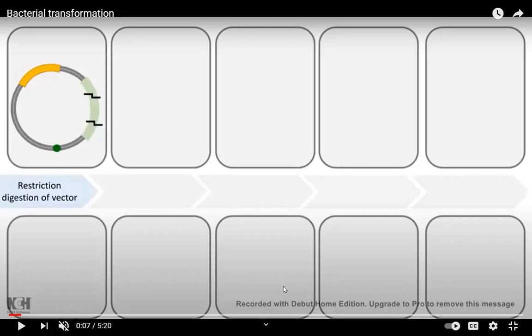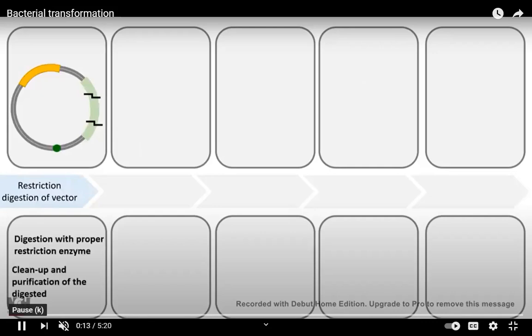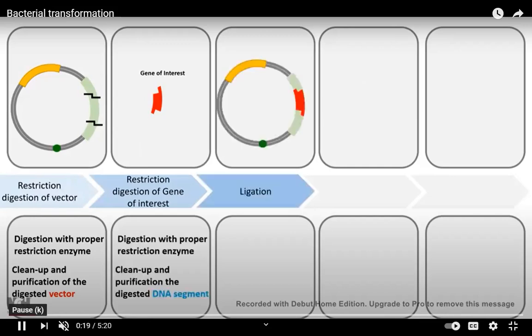The first thing that we would do is use what is known as a restriction enzyme to break open the section of DNA that we're looking for, and that is done using enzymes that are commercially available. With this, we're going to take that specifically sectioned off gene, the section that we are interested in, and then we're going to insert it into the bacterial DNA.